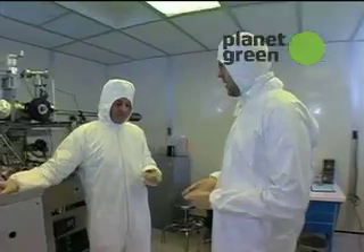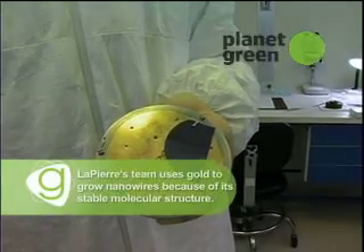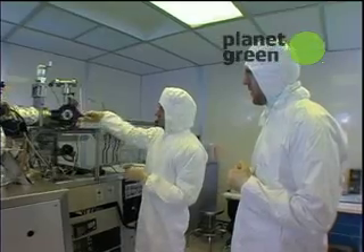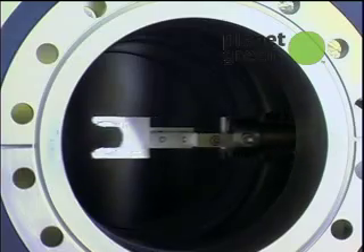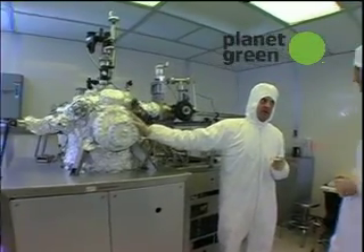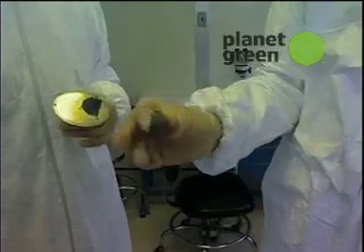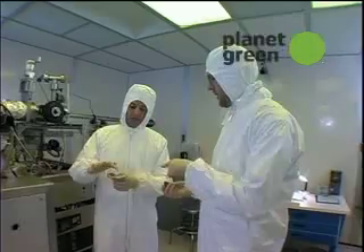We're in the clean room. We need to seed the surface of this silicon wafer with gold nanoparticles. Then the wires will grow off the gold — exactly. We load the silicon into this chamber, and then we have this long arm that can pick up the sample and push it into this chamber where we evaporate the gold. We use a beam of electrons to heat a pot of gold. A pot of gold is inside this machine — this would be full of gold. And then a beam of electrons would hit it, and some of the gold would evaporate and get all over that. Then we have the gold on the surface.